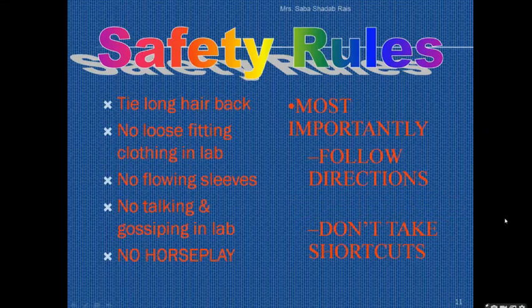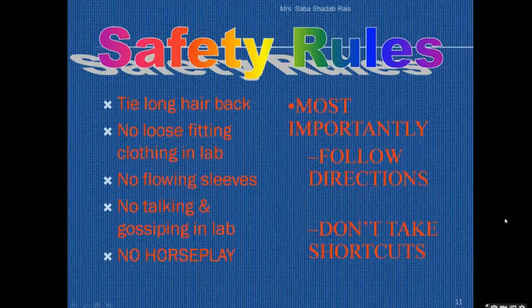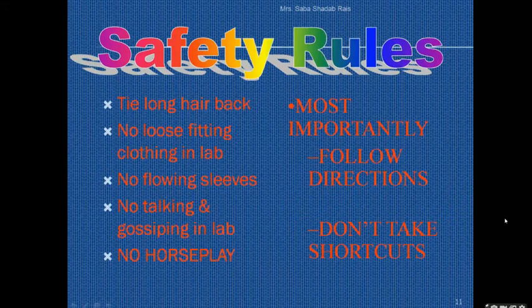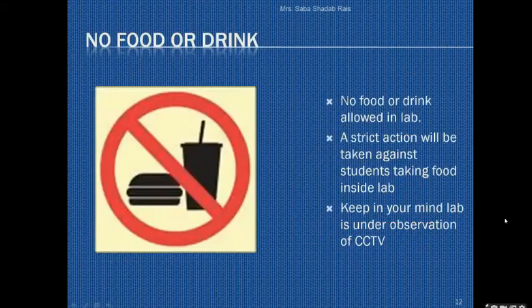Accurate quantity of reagents must be taken. If I told you that 2 ml is given in the protocol, you should not say, I will take 3 ml, you will get a better result. No, absolutely not. You should take the accurate quantity for the accurate result. Most importantly, you need to follow the directions. You should not find any type of shortcut, like saying this chemical is available, first I will put that, then later I will put the one kept far away. It should not be followed.